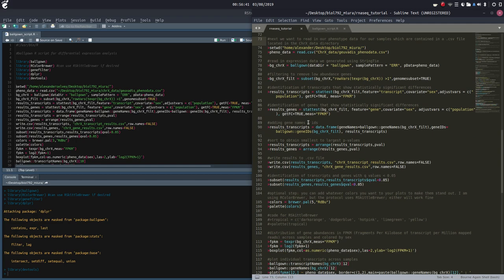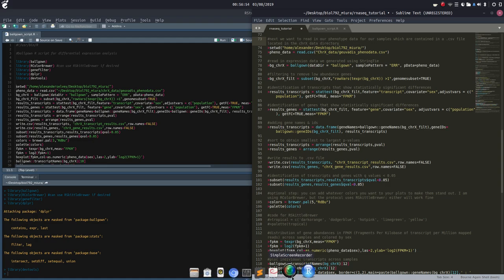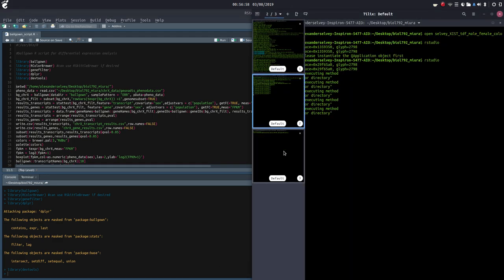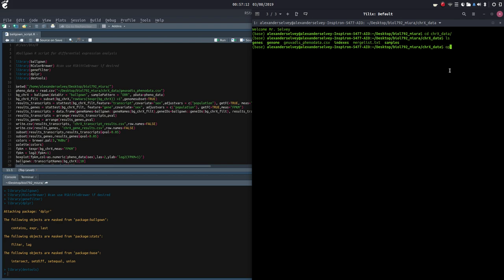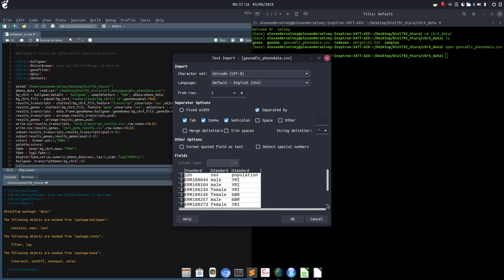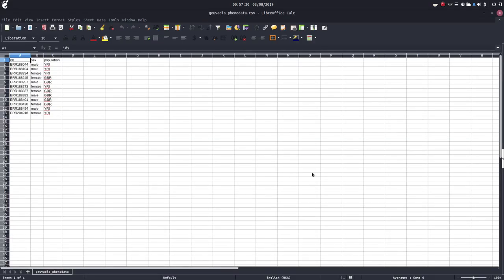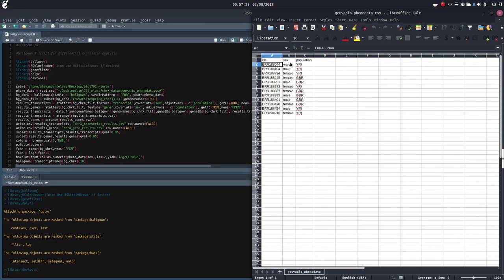We've got all the packages we're going to need loaded. The first thing we're going to do is read in our phenotype data, which are contained in the CSV file loaded in the chromosome X data directory. Let me show you what this file looks like. We're going to change into our chromosome X data directory — and here it is. It's this geuvadis phenodata CSV. Let's open that up.